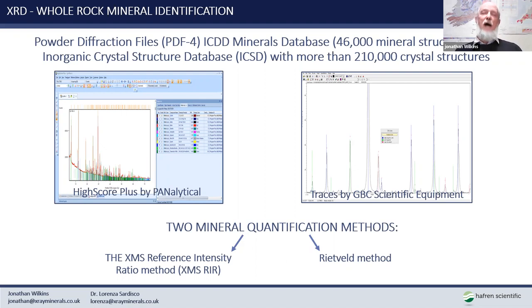So you could actually use the whole thing in an upside down kind of way to say that if you have a particular diffractogram, that is the pattern of peaks with their varying intensities on the diagram, that diffractogram is a composite of the output from the diffraction of each of those pure materials. And if you are able to match the intensity that is measured from the mixture, then one of the things which must be known as an output is the abundance of those materials within that mixture. So that is the quantification of the mixture which you have been measuring.